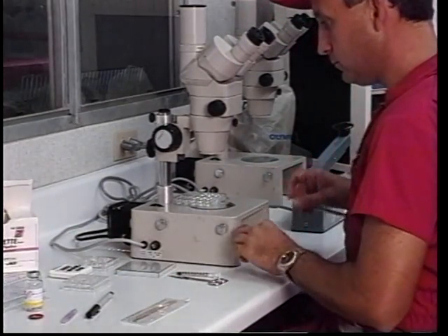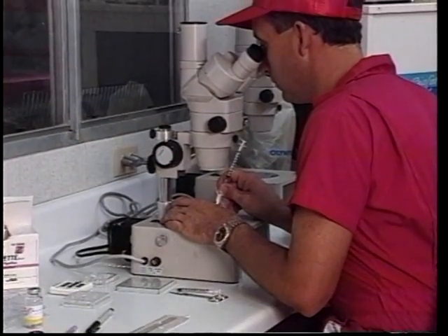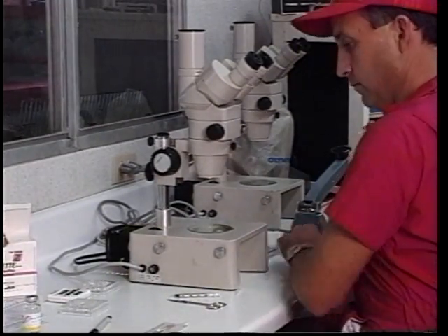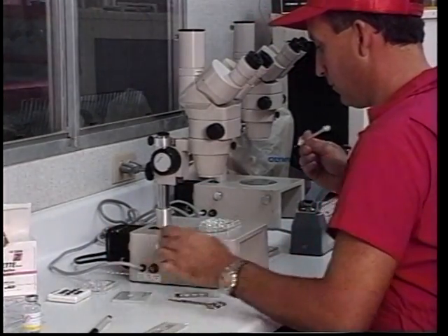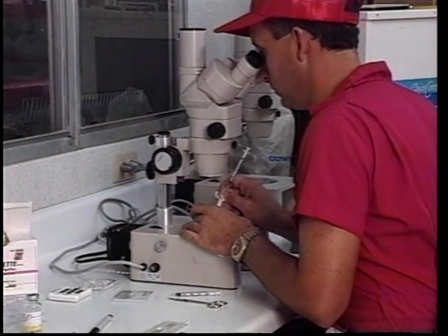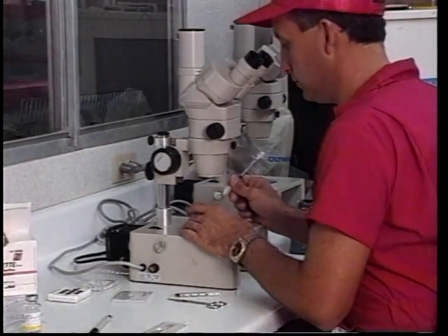The washed embryos can then be moved back into the unipet. Then using the glycerol dish, place the embryos into well number 1. This begins the dehydration process. We start our 15-minute timer, slowly wash the embryos around in well number 1, assuring that we are getting a good mix of the solution that we added to it.